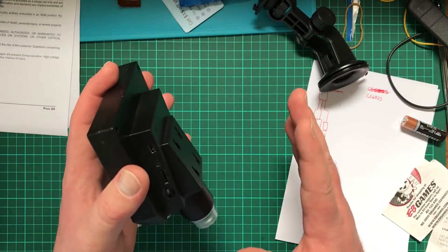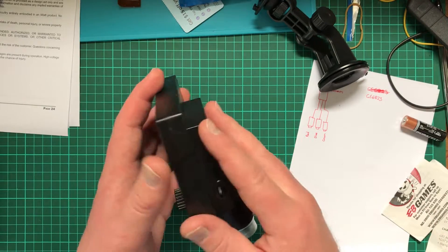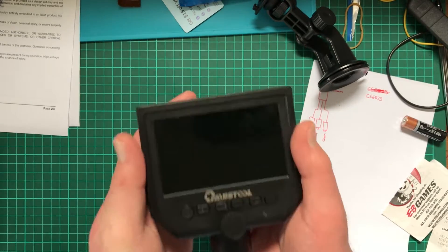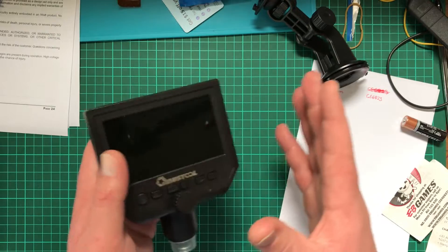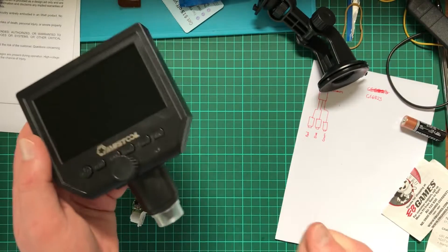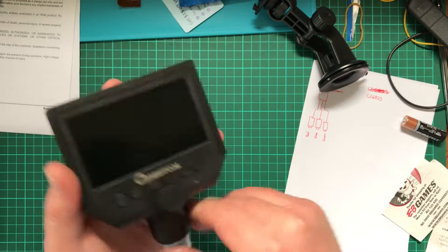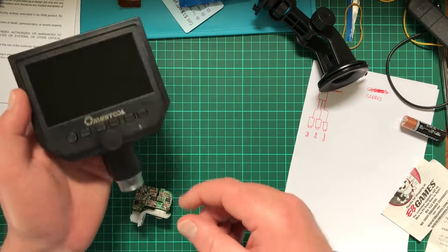What I have found is that long arm mount that I've been sort of freaked out about before — this will hold it up, but there is a bit of wobble. So that's something you probably should be aware of if you're thinking about getting yourself a setup like this. If you give the table a bit of a bounce or someone taps it, this whole thing's going to wobble — same sort of thing that will be going on with my recording device up here.